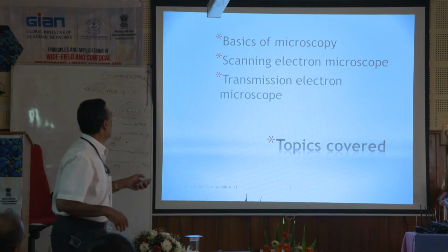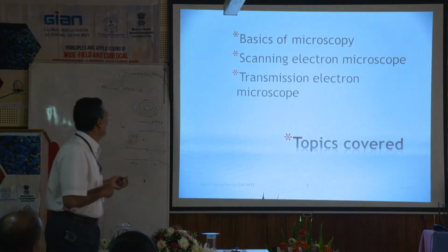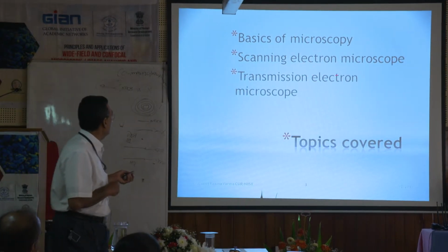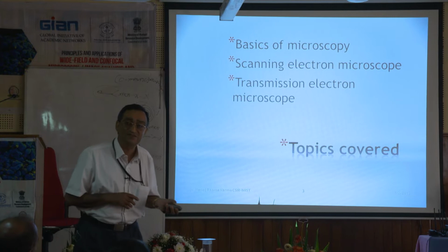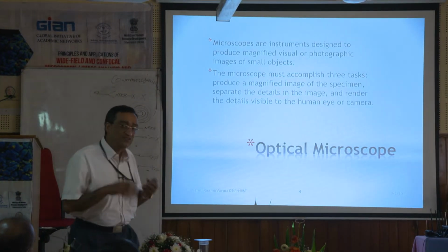The topics I am planning to cover today are the basics of microscopy, the scanning electron microscope, followed by the transmission electron microscope, and the microscopes.